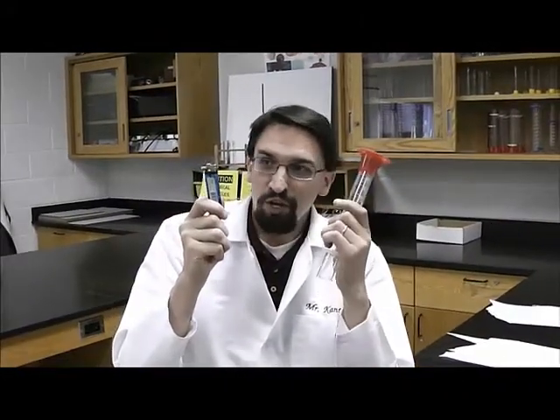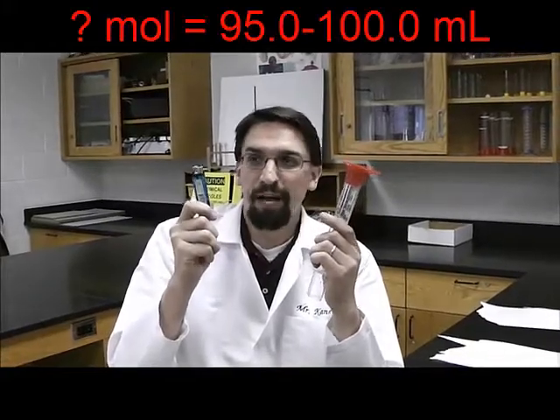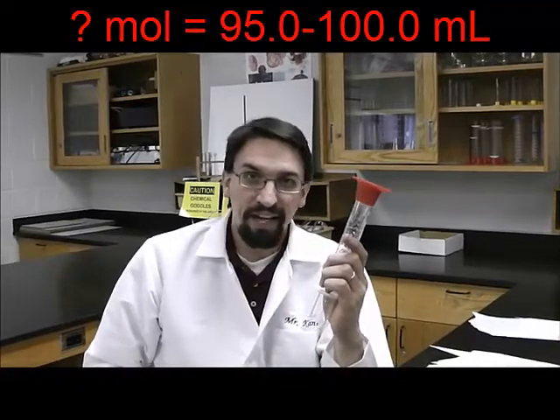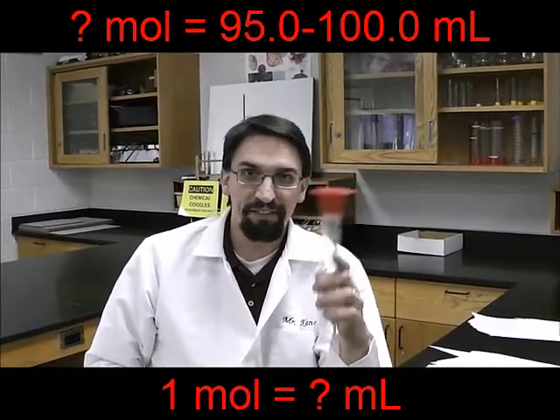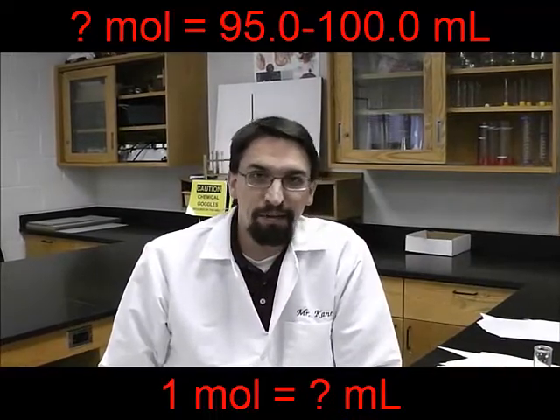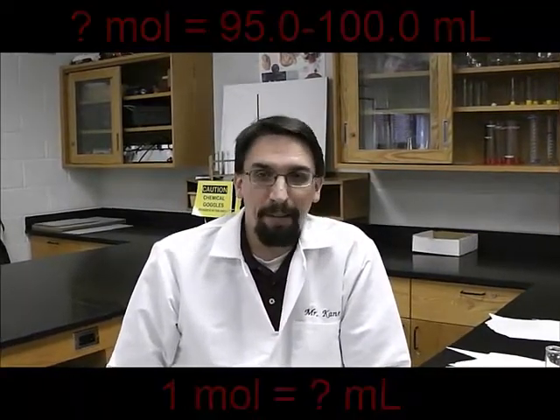In this lab, you're going to take a butane lighter and fill up a graduated cylinder with butane gas. You're going to be able to figure out how many moles of butane gas it takes to fill up the graduated cylinder. And you're also going to use some proportional math to determine what volume an entire mole of butane gas would take up.